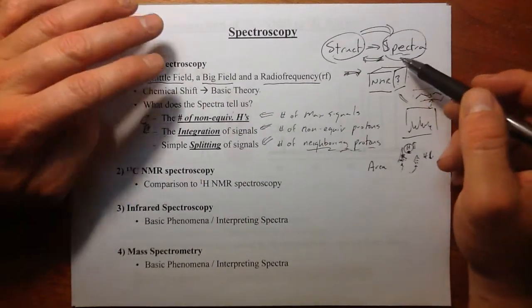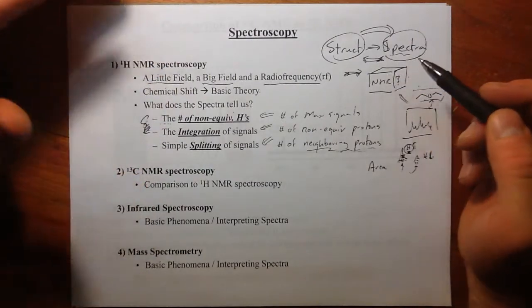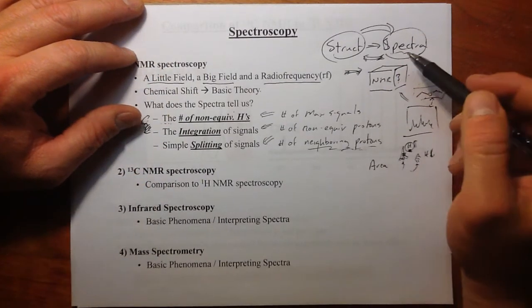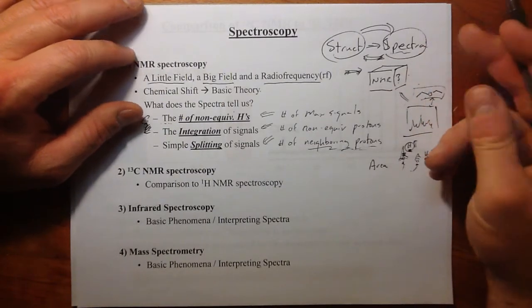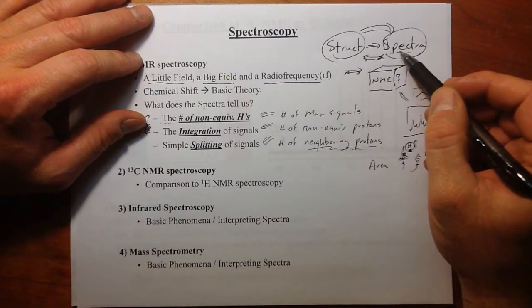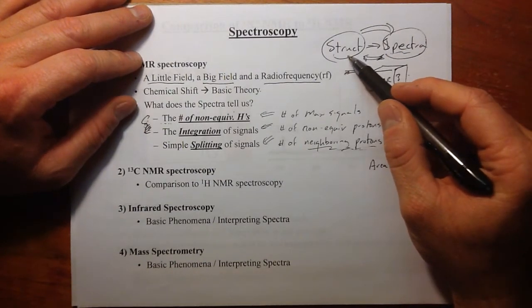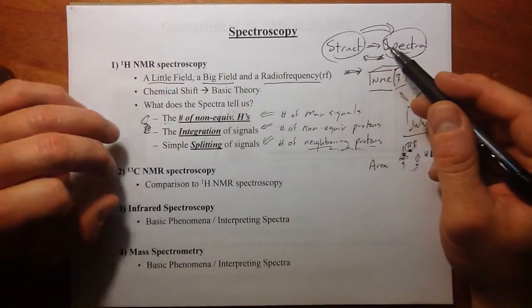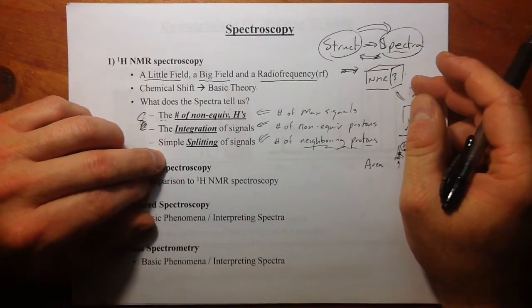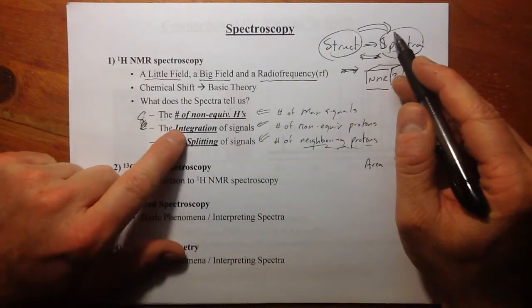And in the last video we did the harder task, really not using any new concepts but just applied to a different problem. We started with spectra, and with some information about the molecular formula either through mass spectrometry or just given, we can take spectra and mass and molecular formula and determine a structure that fits the data. And we really still looked at those 3 issues of number and position of peaks, integration, splitting. But when we went spectra back to structure, remember, we really started with integration.